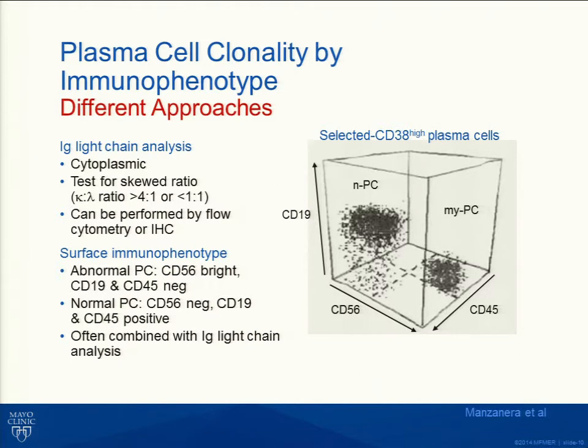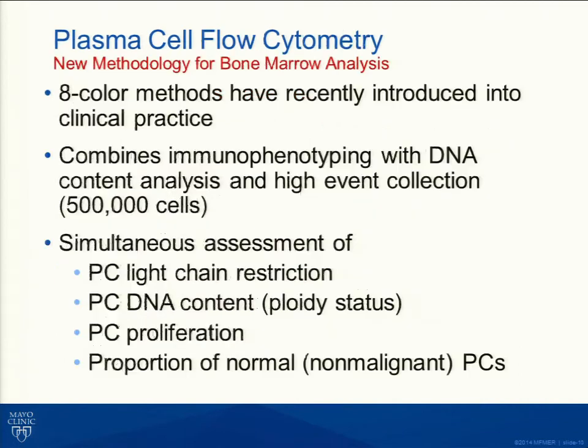There's a real push now nationally and internationally to standardize how we do plasma cell flow cytometry, and most methods actually now are a blend or a hybrid of both approaches. So what do we do at Mayo Clinic?